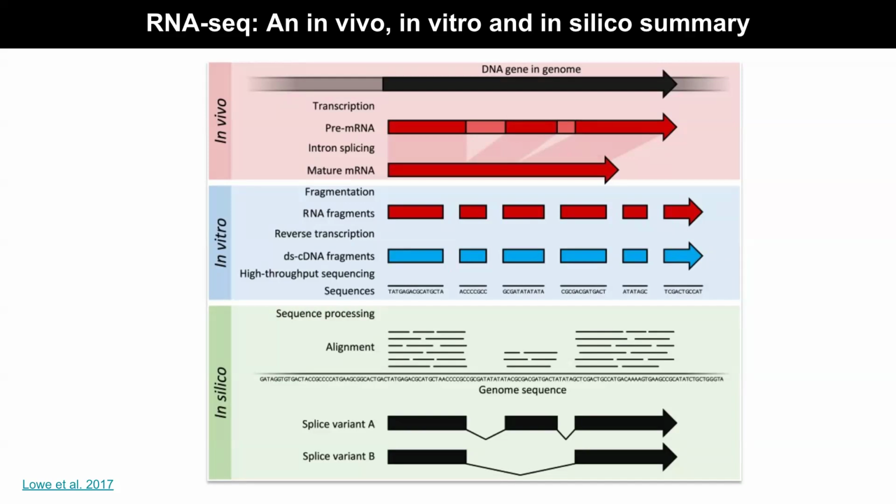You're going slightly ahead. So barcodes, by barcodes, do you mean PCR handles? Barcodes are different otherwise. Are you talking about single cell stuff or no? Okay. So yeah, the PCR barcodes will be added towards this end. The reason you're doing the fragmentation first is because the RT is more efficient this way. It's the same mechanism whether you have to synthesize the entire DNA all over again, but the DNA polymerase will start to veer off at some point. So it's not exactly the same, especially because this is happening in vitro in some fashion. So you shear it first and then you do this. Okay, is that reasoning clear?